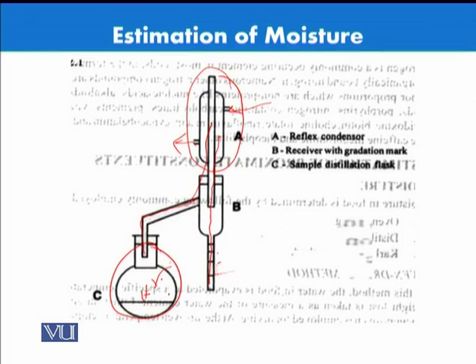This process is repeated several times. Whenever there is an extra amount of solvent that comes on the top, that solvent would siphon off again back into the flask. So here you would get the exact amount of water calculated directly from this graduated flask.